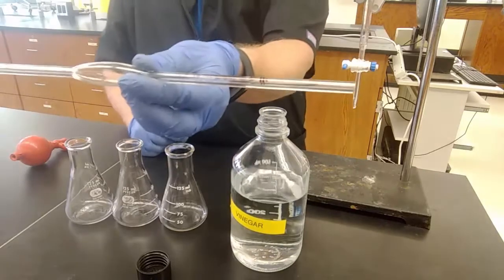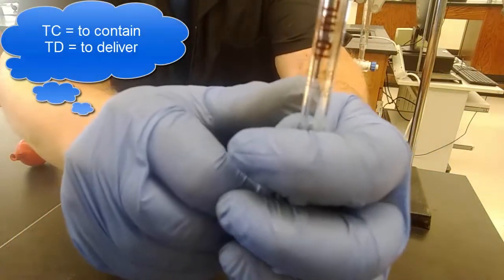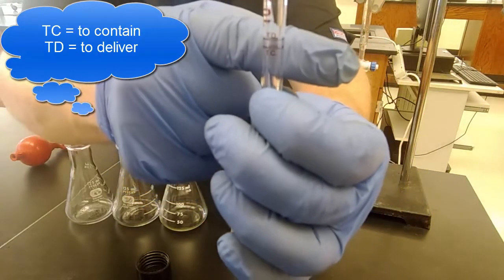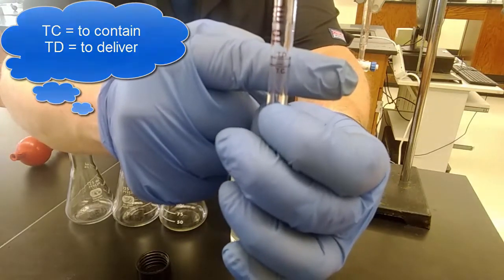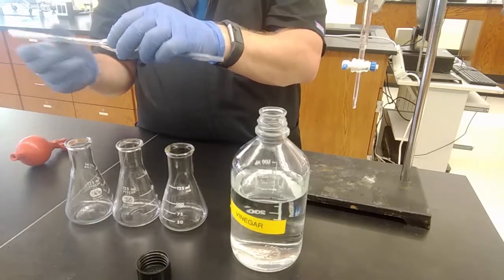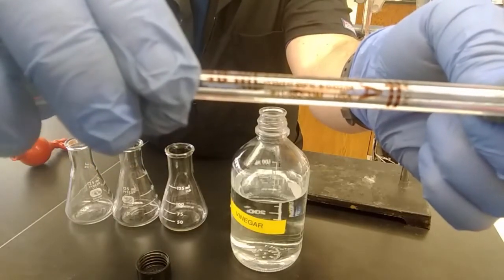And I'm going to use a volumetric pipette, which this one is interesting. It has both a TC and a TD line. Most pipettes are just TD, so that's the line that we're going to use because we want to deliver 10 milliliters. And on here, it should say somewhere what its plus or minus is. It's usually 0.02 milliliters. Yeah, it's on there, but it'll be impossible to read on the camera. I'll try and show it to you anyway. Plus or minus 0.02 milliliters. So a very, very precise measuring device.